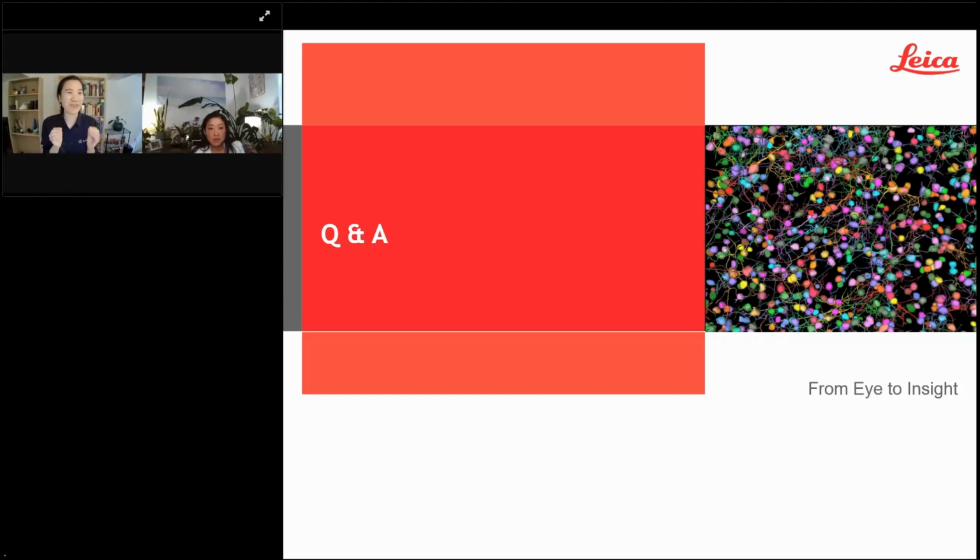If it's not, and I'm wrong, you do have the option of a much larger list of measurements in our measurement tab. By default, not everything is calculated for you, but you can go in there. It's all pre-programmed into Avia. You just simply have to select the measurements that you want from the list, and then Avia will run those measurements for you. And velocity is definitely a part of the list of measurements.